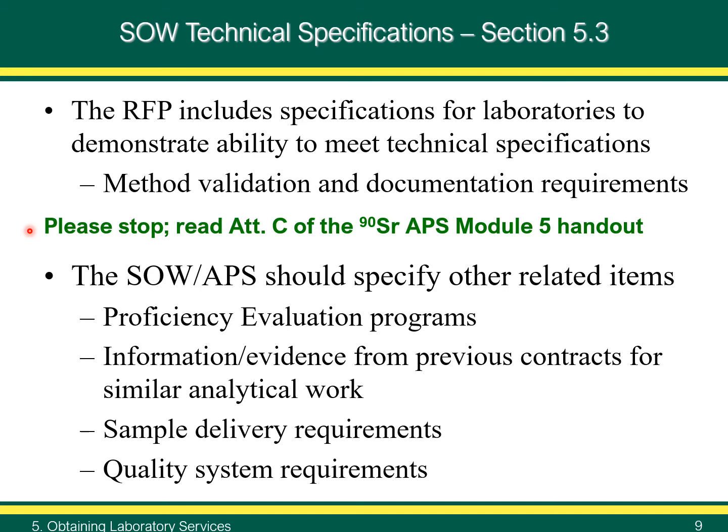In looking at attachment C, you'll see that if the laboratory has previously validated the method for a required analyte matrix and activity level, method validation level A would require no additional validation. If the laboratory has a method in place for a similar matrix, level B would apply, and 3 replicates are required at each of 3 test levels.